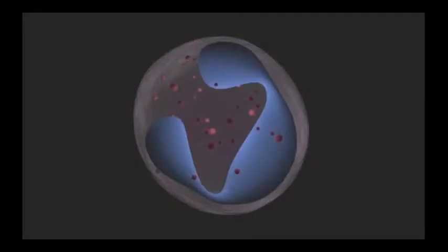In addition to analyzing a cell's size, shape, and complexity, a flow cytometer can also detect emitted light from excited fluorescent molecules, such as fluorescently labeled antibodies or fluorescent dyes or stains. In this animation, we will focus on the detection of fluorescent signal by the flow cytometer. For more information about fluorescence, please see the fluorescence animation.